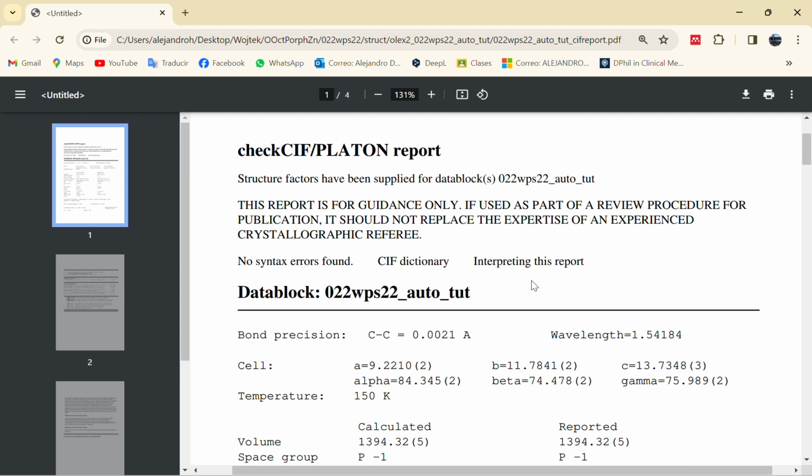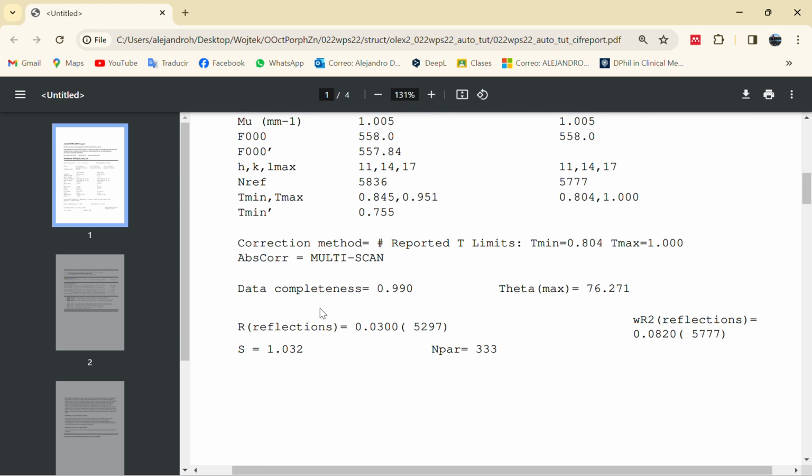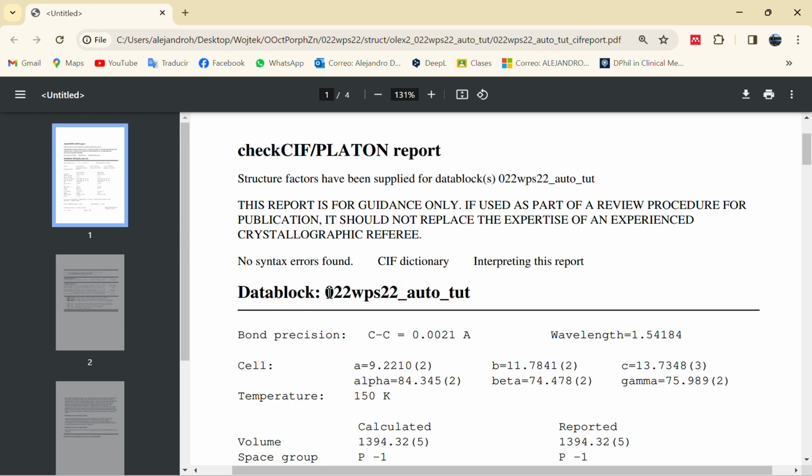Yeah, so basically everything's okay with our CheckCIF file, and the data is more than appropriate to publish in the Cambridge database. So if you'd be preparing this file for publication and you need to attach the CheckCIF file to the submission to the journal, you probably want to have here a name of your compound, like in your manuscript, right? So for example, zinc porphyrin.